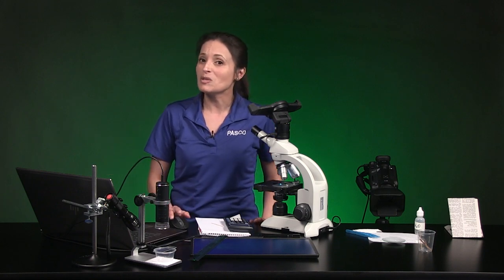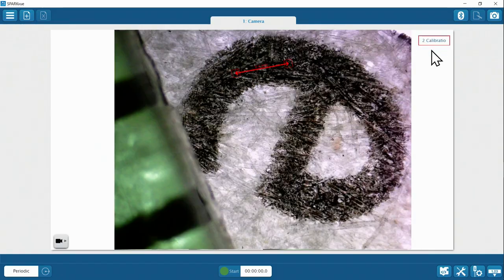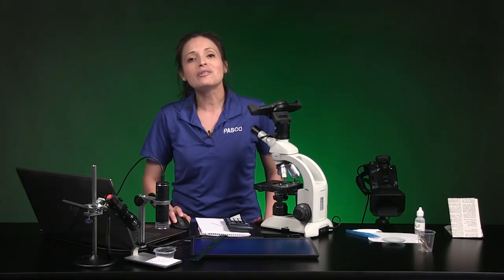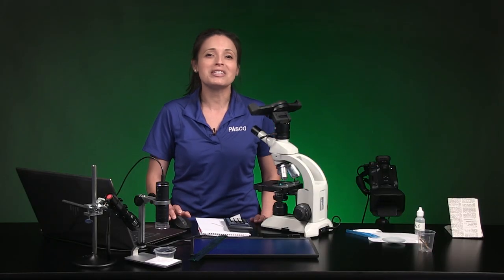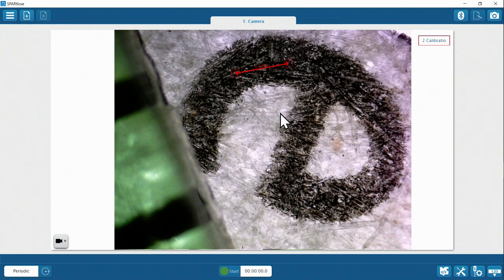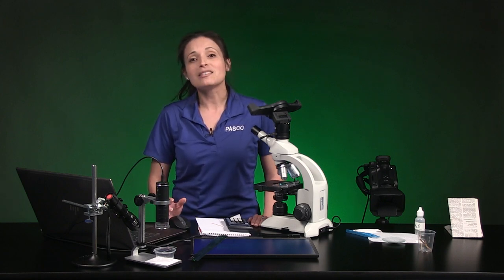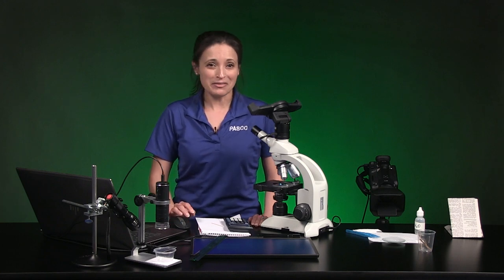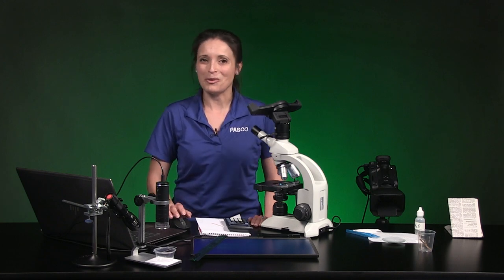Anytime you want to do measurements on an image, you need to include a measurement tool of some kind in the microscope view. Now on your own in the sample SparkView data file, measure the long part of the letter E from one end to the other. In the second row of Table 2, sketch what you see in SparkView showing the measurement tool position on the letter E, and record the length in millimeters in the notes column. Pause the video and press play when you're ready for part 4.